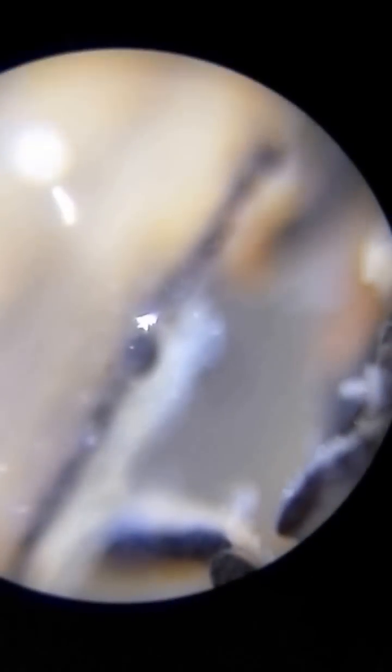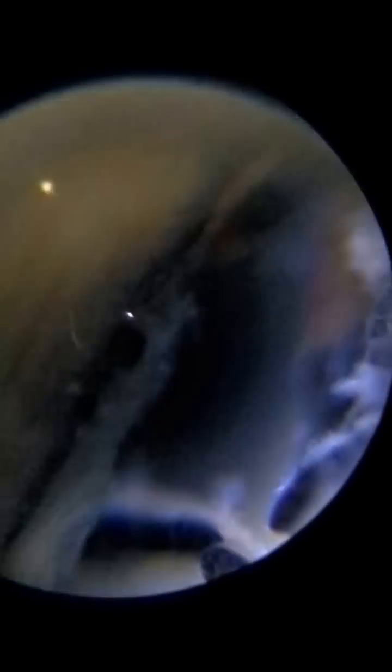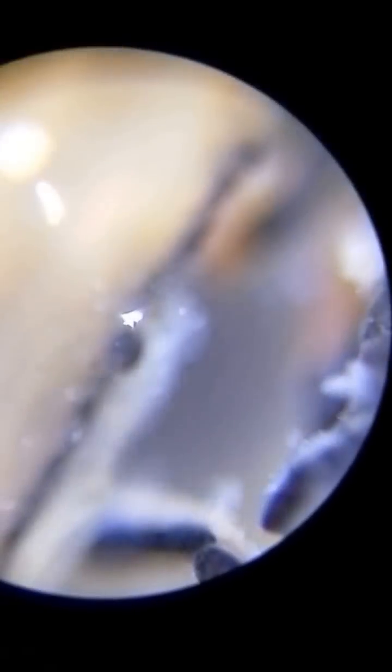Hold it right — that's my problem. Let me move the specimen real quick. It's on the slide right there. Give it a little move. See what we have to look at now. Fix the focus — not focused right. I'm going to focus, I'm going to change it. Hold on a minute.